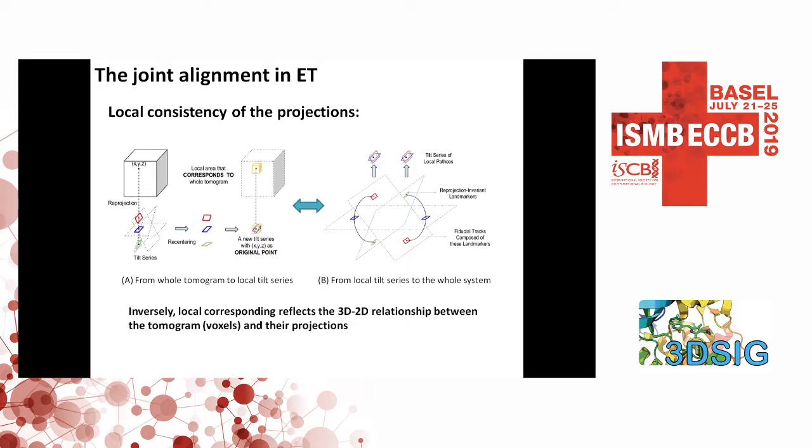This is our observation, and from it we design such a process. We decompose the whole problem into small ones, from the small ones we get the virtual markers, and then from the virtual markers we come back to the global problem.